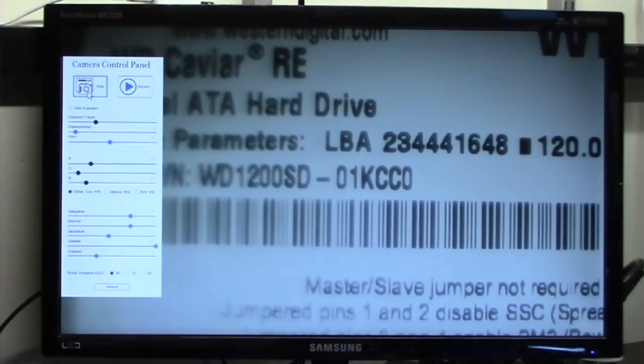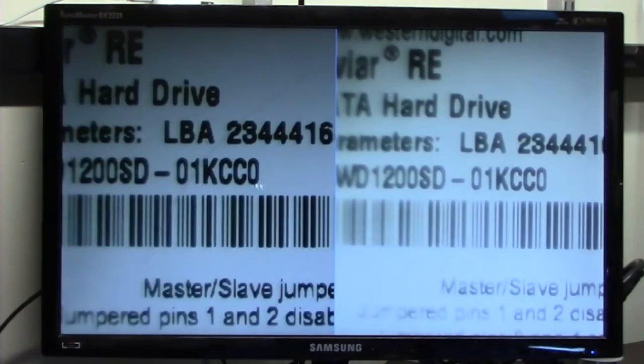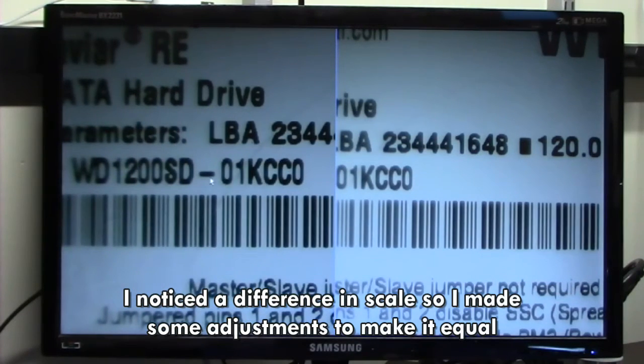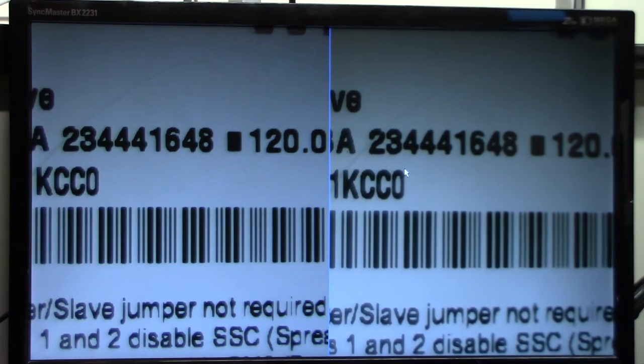Let's take a snapshot of this before I forget. We can actually do a comparison of images now. On the left side is my 050 lens reduction. Maybe I should try to turn the light down a little bit because the 0.3 does seem to bring in more light. Focused until about the 2 or 3 here. This is the live image on the right side. And over here, 2 and 3 are still nice and clear. I'd say we're clear up until about the D in hard drive. To be fair, the magnification wasn't exactly the same, even though it's already zoomed all the way out. The magnification did change slightly.